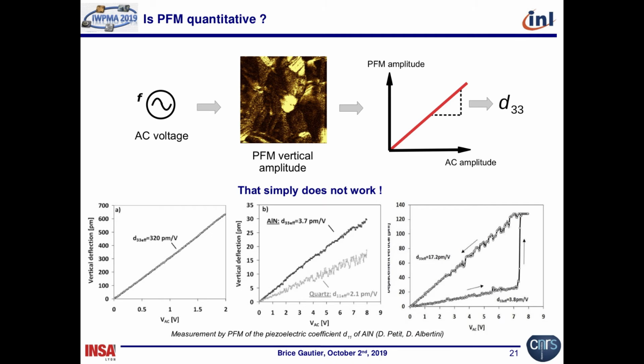Now, we're talking about the amplitude of PFM. I will talk about that on Friday during the session on characterization methods of this conference, but just to give an idea. Many people come to the AFM with the desire of getting some quantitative results in terms of d33, for example. So they want to know the d33 of aluminium nitride or PZT or things like that. It seems very simple to do.